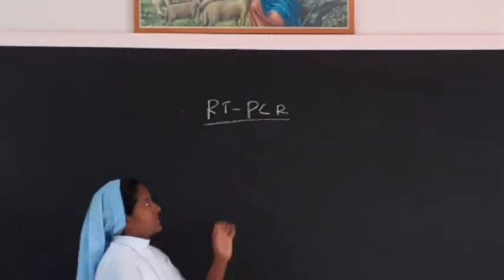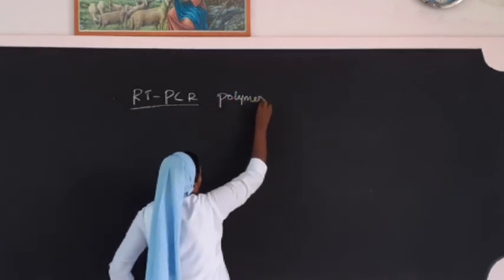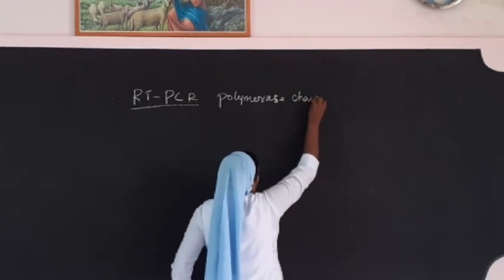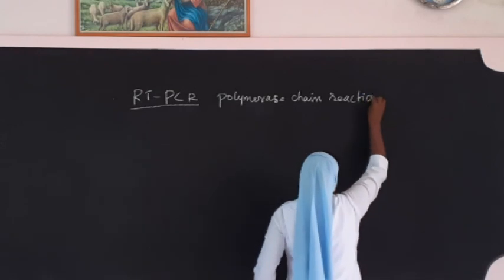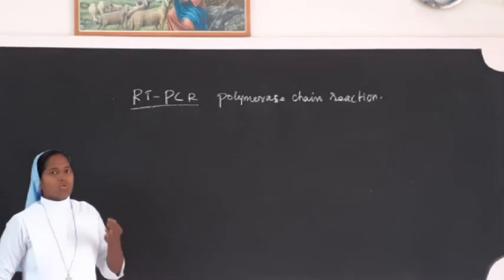What is PCR? PCR means polymerase chain reaction. What are the uses of this technique?